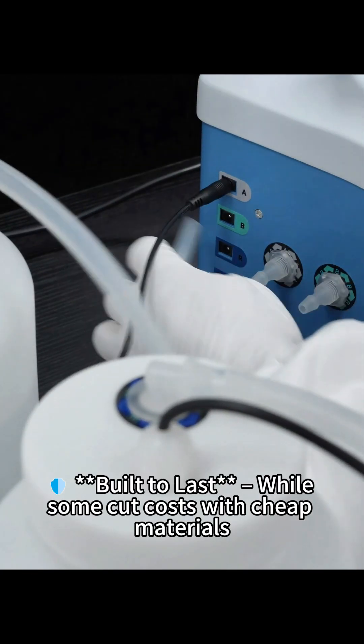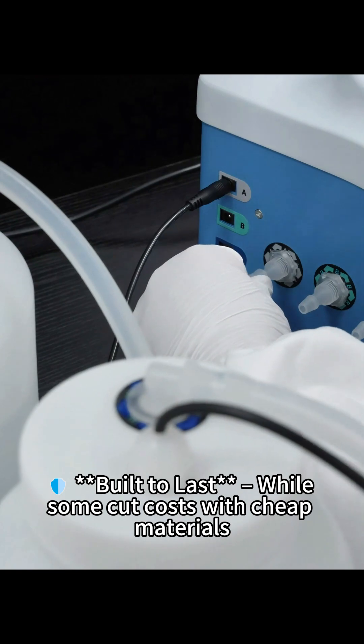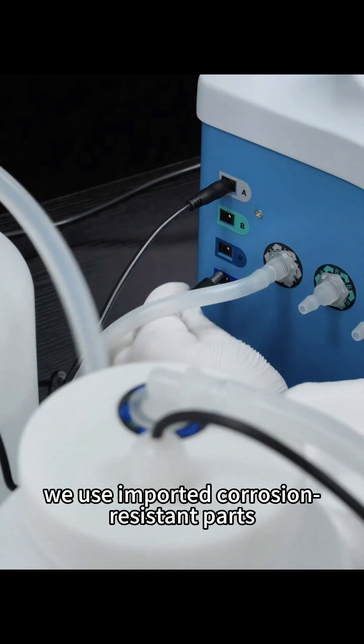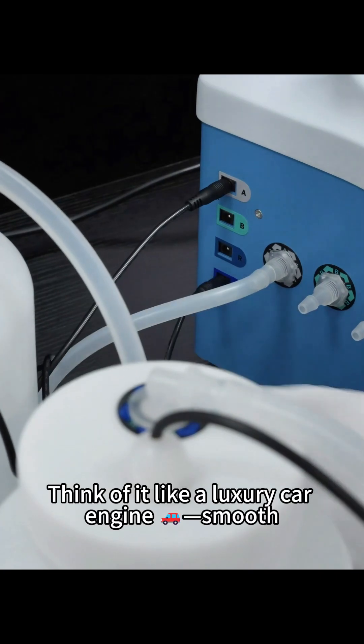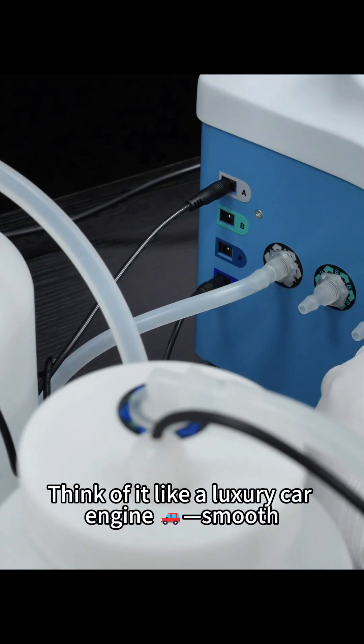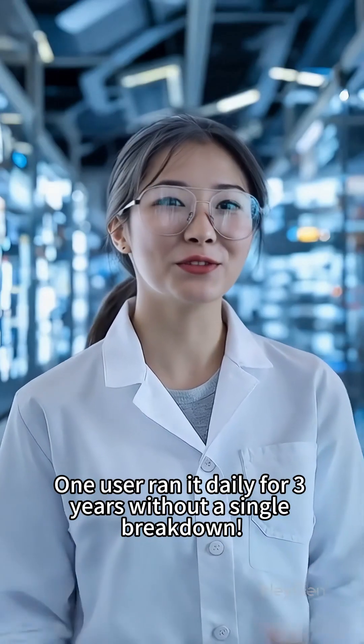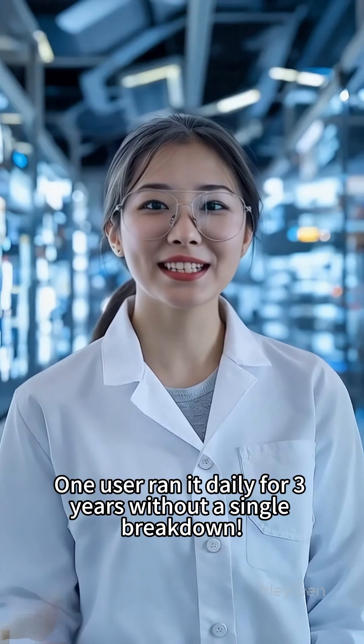Built to last. While some cut costs with cheap materials, we use imported corrosion-resistant parts. Think of it like a luxury car engine — smooth, durable, and worth every penny. One user ran it daily for three years without a single breakdown.